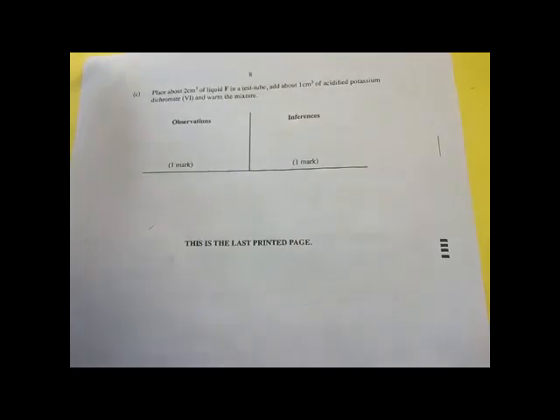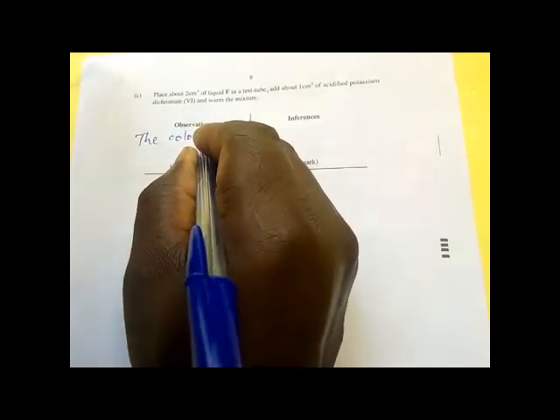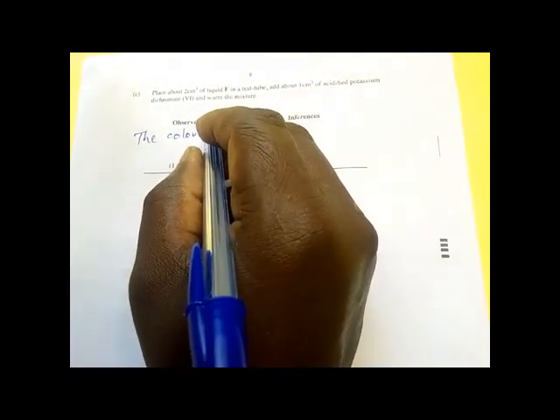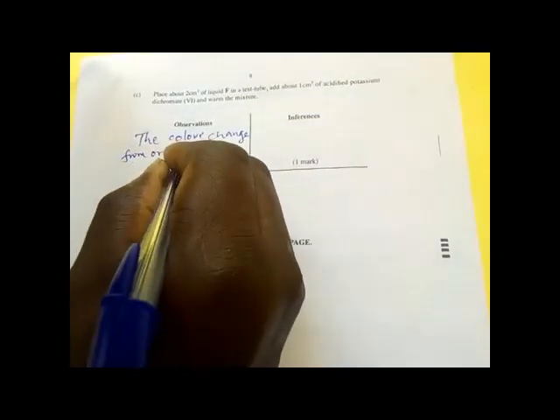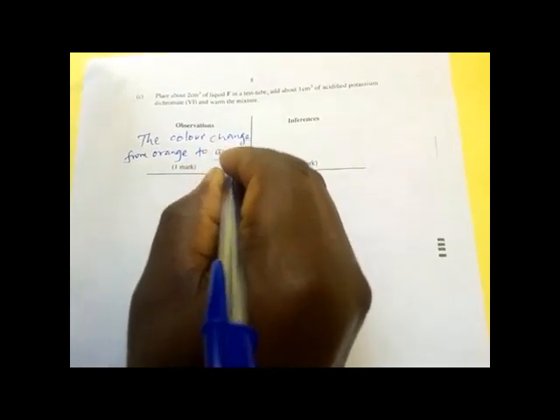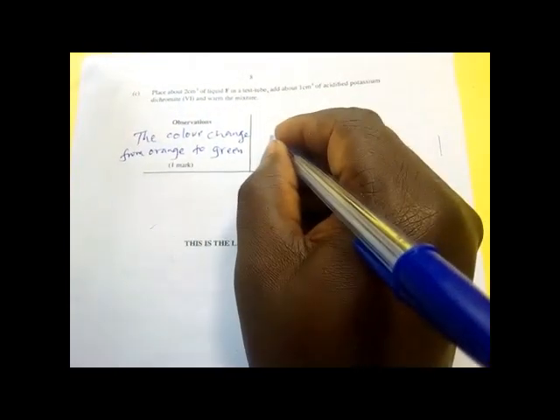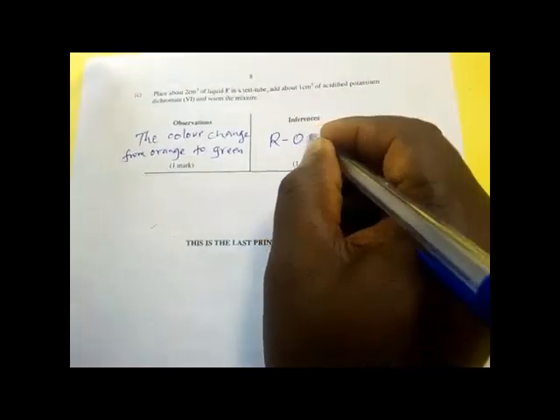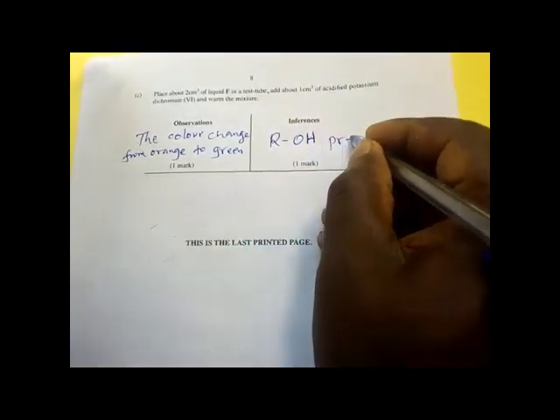Then what happens is that the color changes from orange to green, because now we are dealing with organic chemistry. Then that confirms that the alcohol is present.